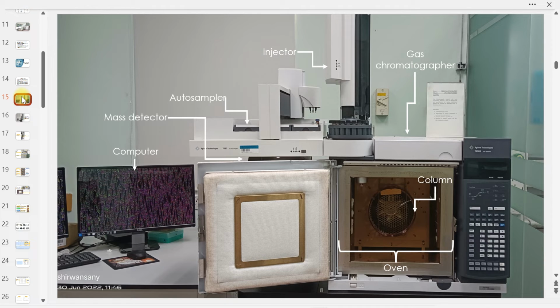Okay, so this one this is the GC TOF actually, sebenarnya this one kita tak sempat tengok dekat lab tadi kan, tapi tak apa. So this is the GC TOF that we have in HUD actually. So again yang ni gas chromatography, the whole thing is gas chromatography GC, and then we have injector as well, and also auto sampler.